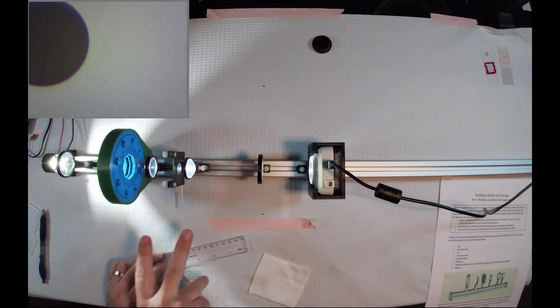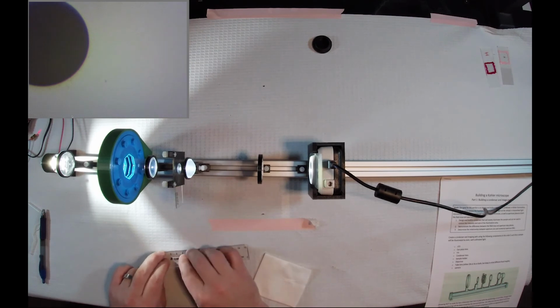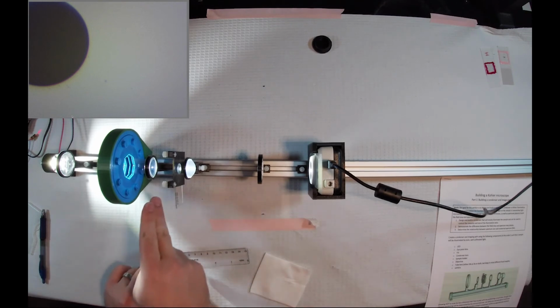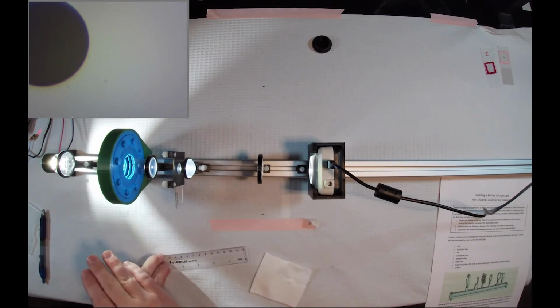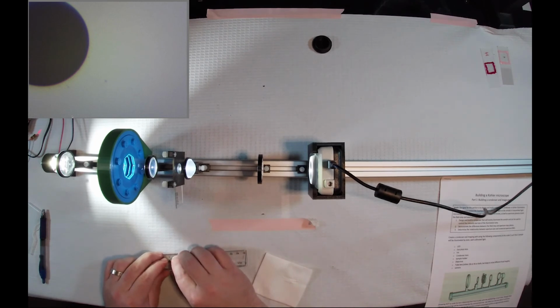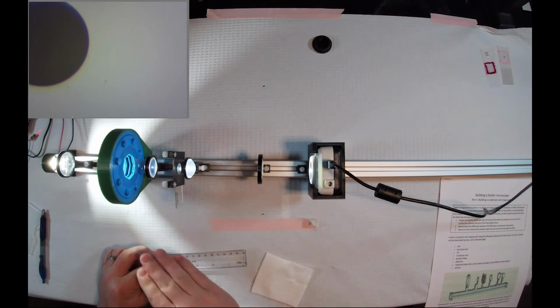And then what is the focal length of this lens? 35 millimeters. And you should be able to calculate the numerical aperture of this condenser lens as when this iris is fully open. It does ask you what is the numerical aperture of the entire system.